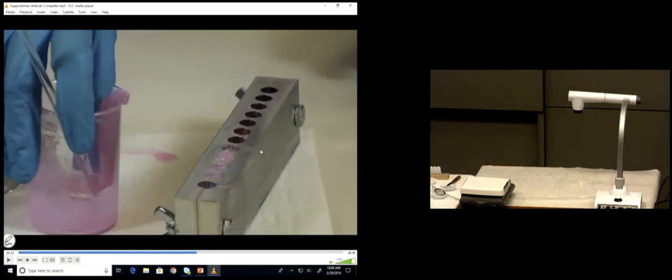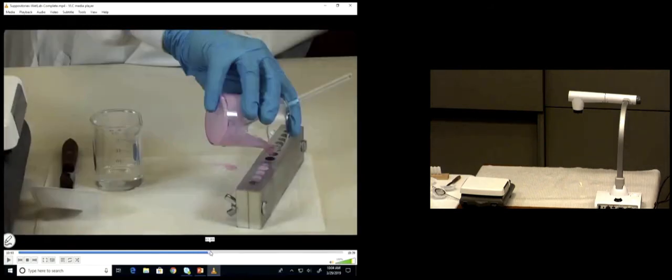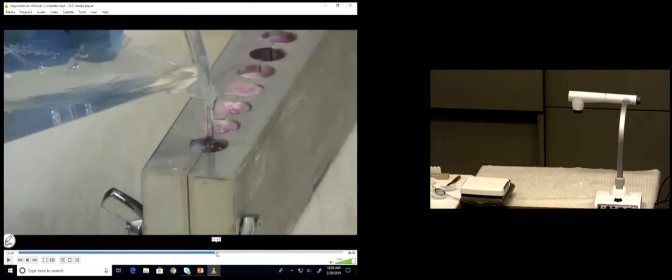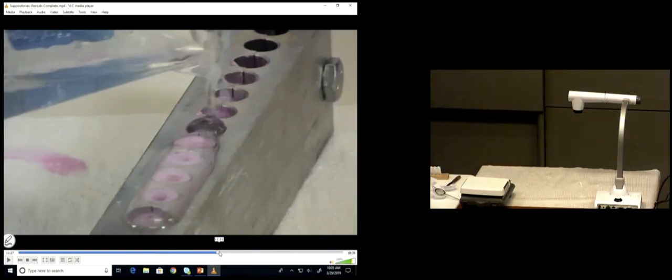Then what do you do? You go back and set that aside, and you don't worry about what's left in that vial. You grab your other clear one with your excess, and this is where you fill it up here. And this is important. You see how this is spilled out and formed kind of a mushroom head. It's spilled on top and kind of gone onto the metal mold. Now it's not spilling and dripping off the sides or anything on the counter, but you want to make sure, I keep doing that, you overfill those enough.